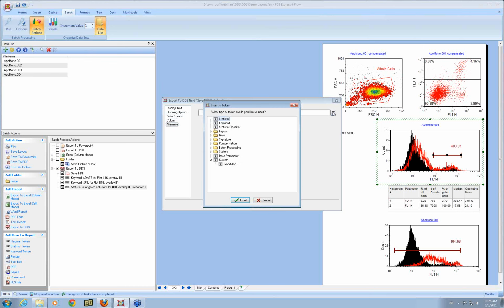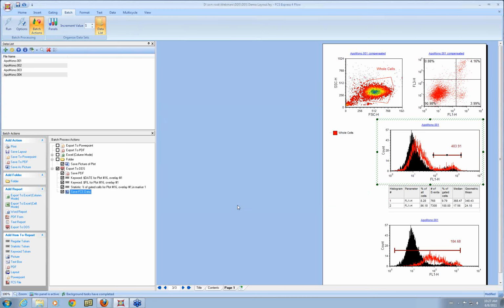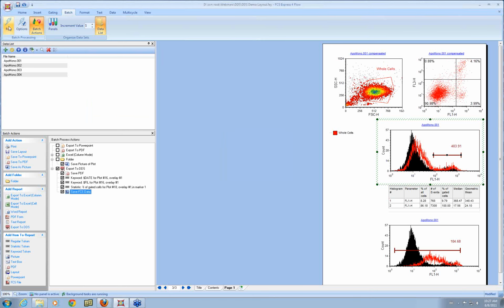And the file name, again, we're going to use the FIL keyword. And I'm just going to type it here and hope I don't do any typos. Okay. And now the next time that I run batch processing, it's now not only uploading the previous 4 columns, but it's also uploading the data file.